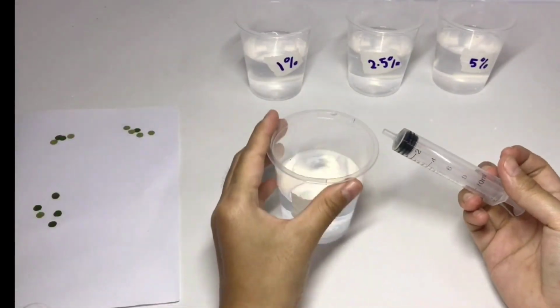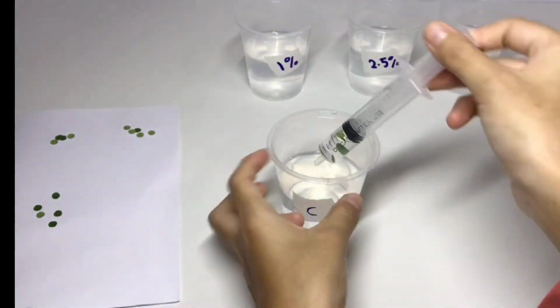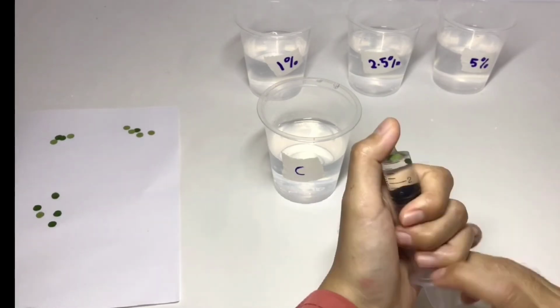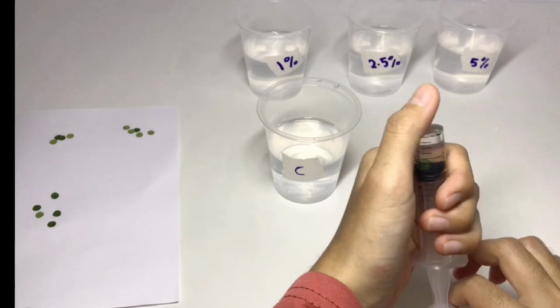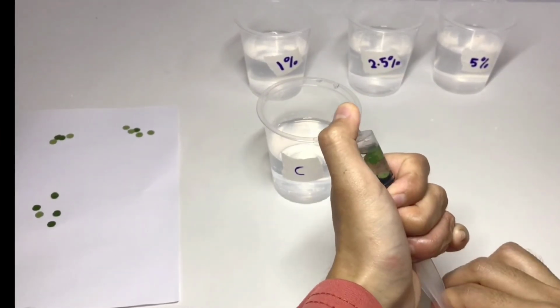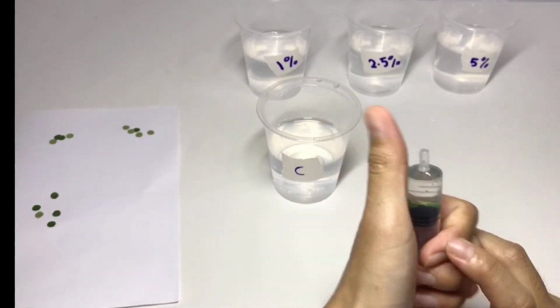Take out all the air from the leaves by sealing the opening with your finger and pulling the syringe to create a vacuum condition. Push all the air out from the syringe as much as you can. Do it several times until all the leaves sink. After all the leaves sink, make sure there is no air bubble on your leaves and syringe wall.